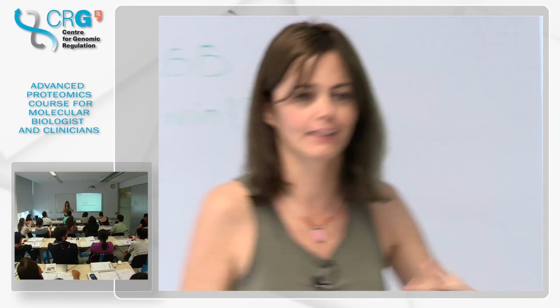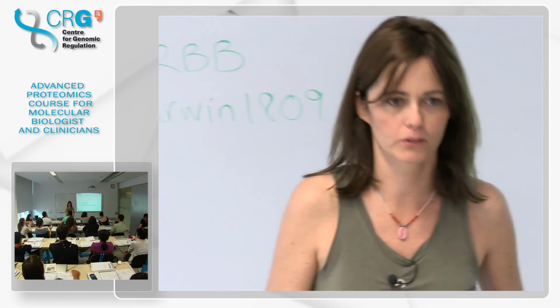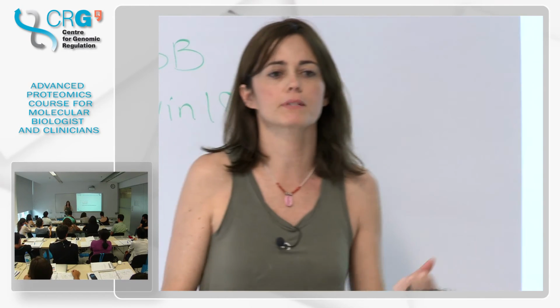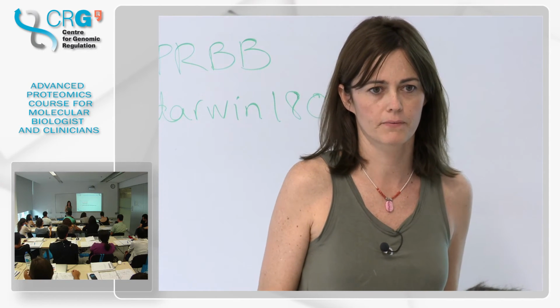How would we quantify this? In the next session, we talk about quantification. But yeah, we look at intensities, areas, all that. The specifics, we will talk about. But yeah, it's important to look at the proteome. We would take that same sample without enriching for phosphopeptides.